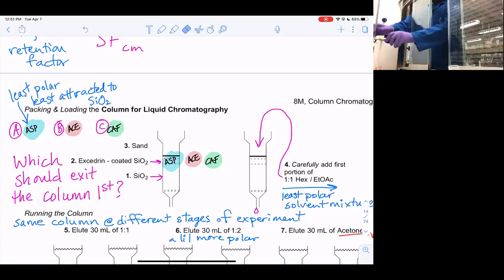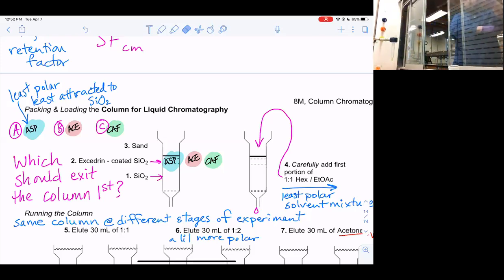So sometimes these clamps can be a little finicky to get them to actually sit right. First thing I do is pinch them together, hold my thumb on the screw so it doesn't try to pop out. And then you can spin the lug nut shut pretty easily. And then that just sits there just like that. And now we should be able to freely add and remove that. I can adjust that later if I need to.